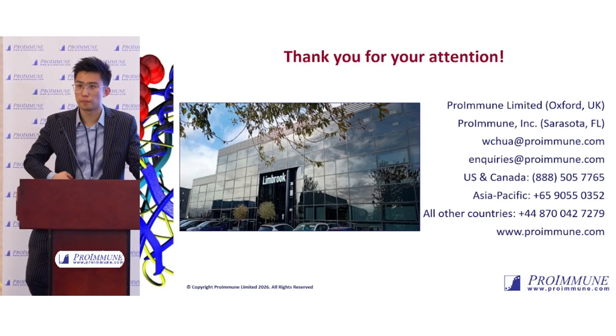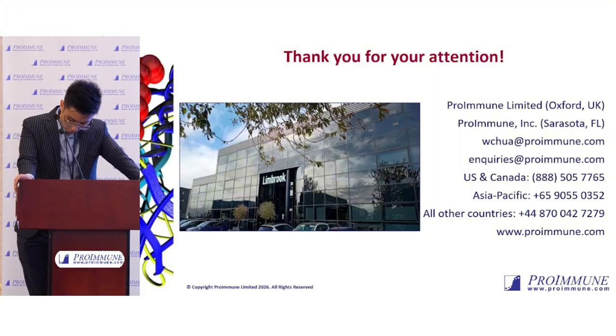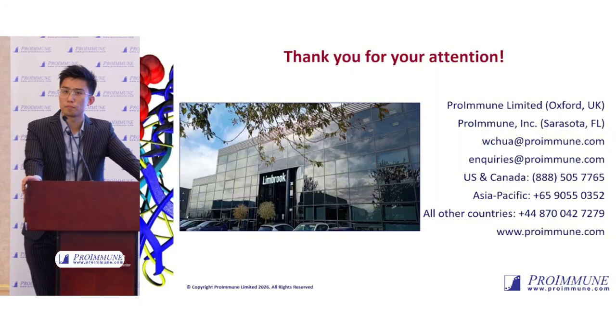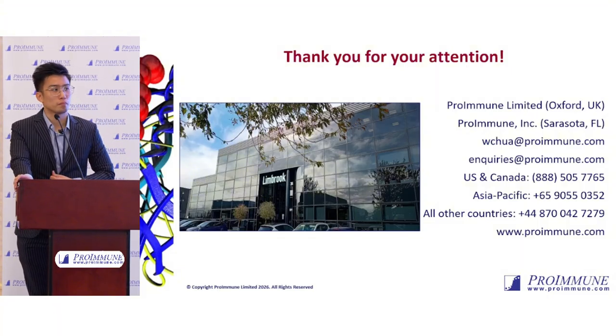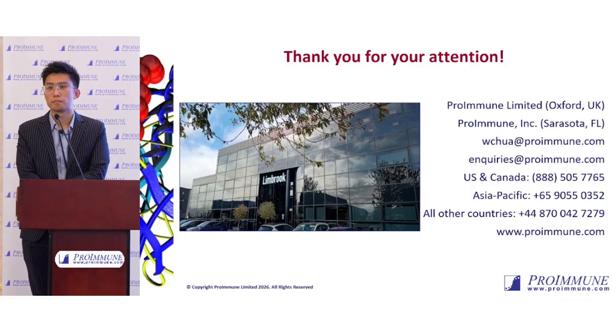What to do next? There are a couple of papers published on that. We published some, and some other people published as well. It could be aggregates. It could be other things, but there are different tests that can be run, different cell lines that have specific receptors that can help you orient as to what kind of impurities are there. But as he said, that's sort of a second stage to help you then clean up the product.